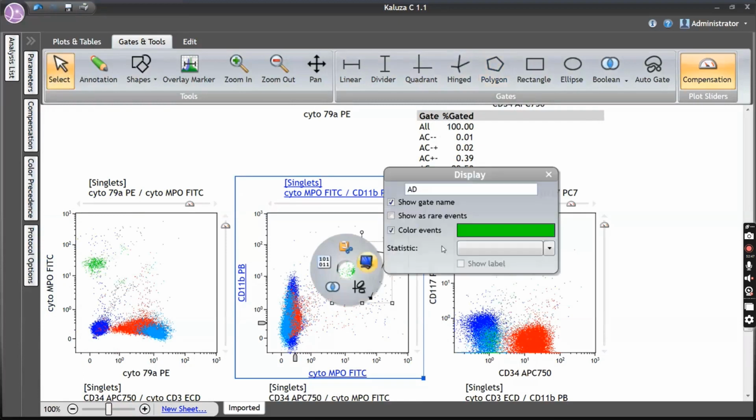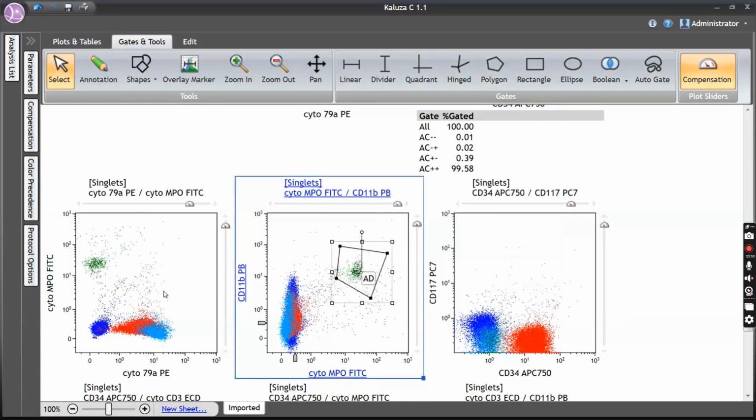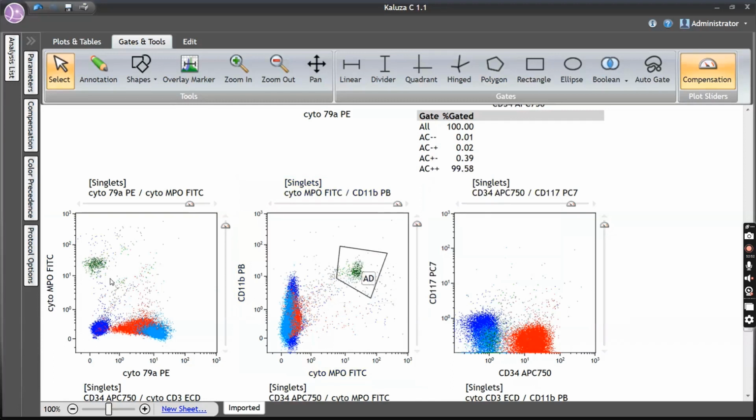So this is neutrophil. I give that green color. And you see the normal internal control for MPO is here. The blast is negative for MPO. It is expressing only cyto-CD79a, and that too in a dim to moderate fashion. Now, summing up this particular case, we have blast around 73% with low side scatter and CD45 in a negative to moderate fashion. It is expressing CD19 in a moderate fashion, CD10 in a moderate to bright fashion, CD20 is positive only in a small subset, CD34 is positive in a moderate fashion, CD38 is negative.